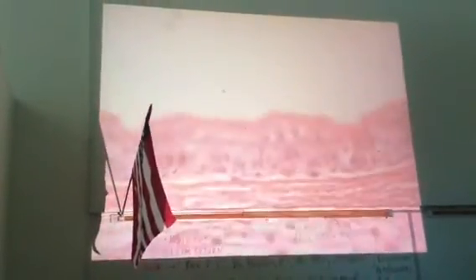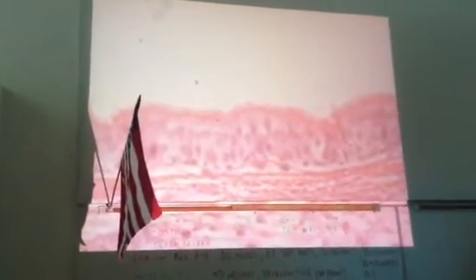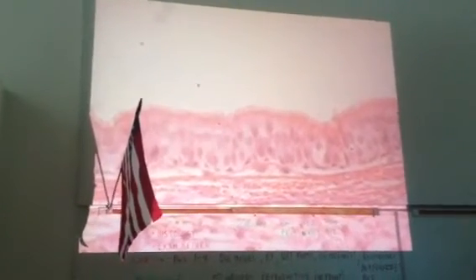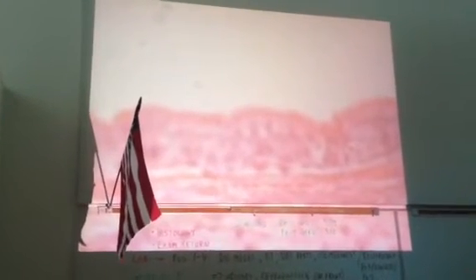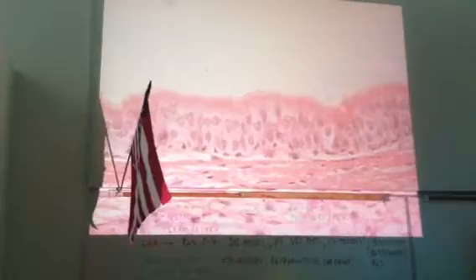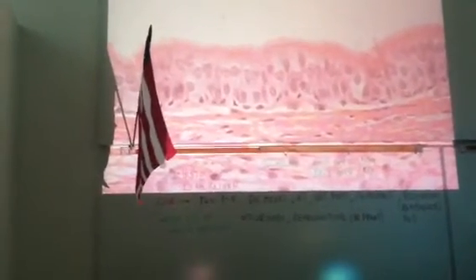All right, so now then, we're going to move in an anterior direction. Posterior is up towards the top of the screen as we look at this. Anterior direction, we're going to come out, and what we'll run into is, on the trachea, pseudostratified ciliated columnar epithelium, and then hyaline cartilage, which is the hyaline cartilage that is going to be down here in the thyroid cartilage of the larynx, or it's also in the tracheal cartilages that we find. And they're C-shaped. They don't go around and connect on the posterior side.